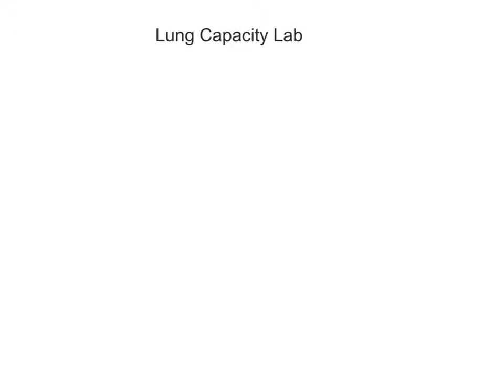Hello! This video is to take you through the lung capacity, molar volume in human lungs lab. We're going to be talking about how to take the measurements, and I'll even do a sample calculation so that you can see what it looks like.